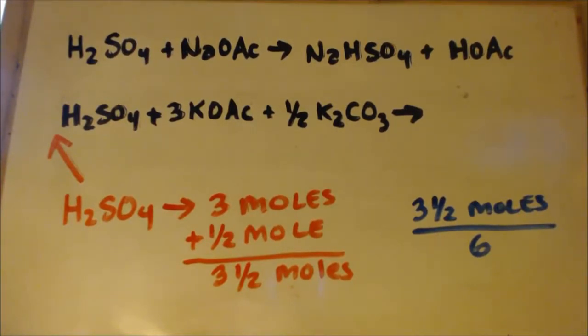And if you did the same exact experiment I did here, you'd have to divide that by 6 to tell you how much sulfuric acid you needed. Because remember, we divided everything by 6 at the end. And that's it. You wouldn't have to worry about recrystallizing it or if it's pure or if it's this or that. You just evaporate all the water. And all the salt that's left, you take it all.